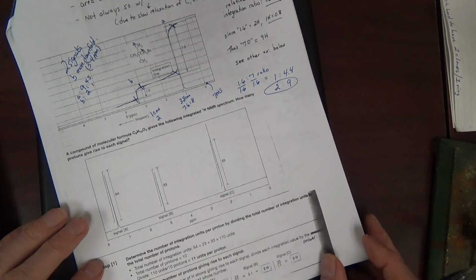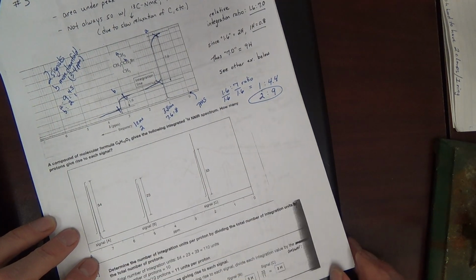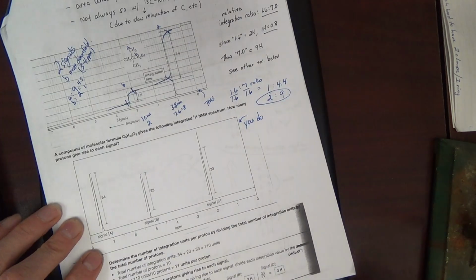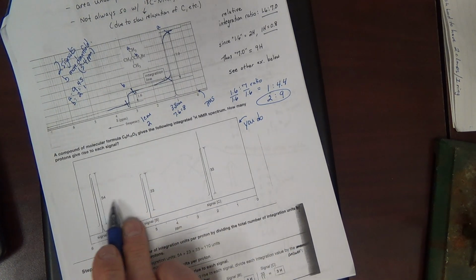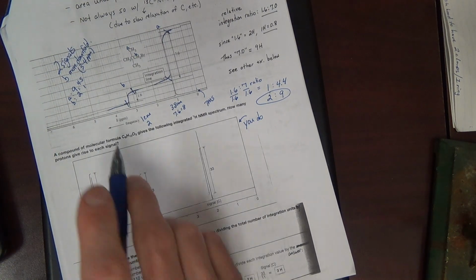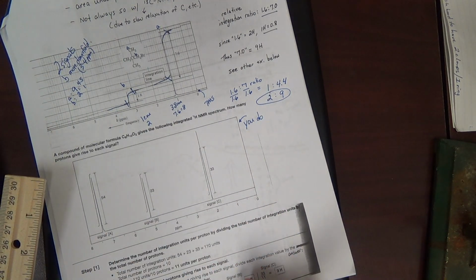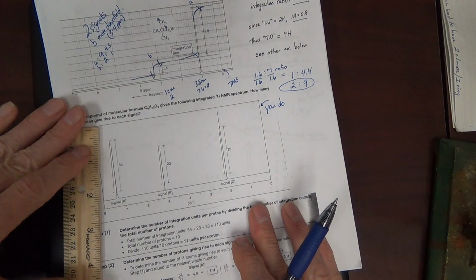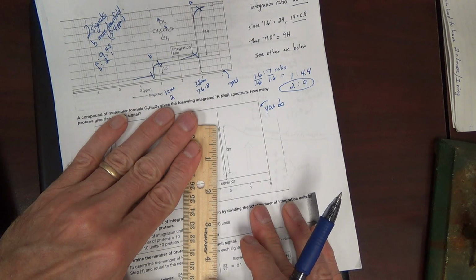All right. This is something that you can do on your own. You do this. Again, these numbers don't mean anything in themselves. This is just a ratio. And I sort of showed you how to work this. Also, you don't have to measure integral lines. They're giving you these numbers. If they didn't give you these numbers, you'd have to get out your ruler and measure the integral lines and then go from there and establish your own relative numbers.